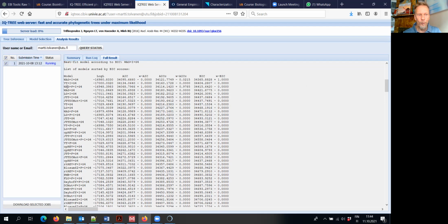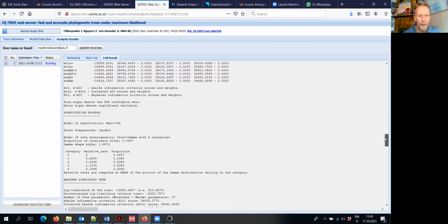And the other option, including frequencies from my own alignment data, would have been pretty high ranking, and I think this is the smallest value for this other information criteria selection. And then here are the results of the estimated best gamma value, meaning that it is using 4 categories, dividing all the non-constant sites into just 4 categories based on how variable they seem.